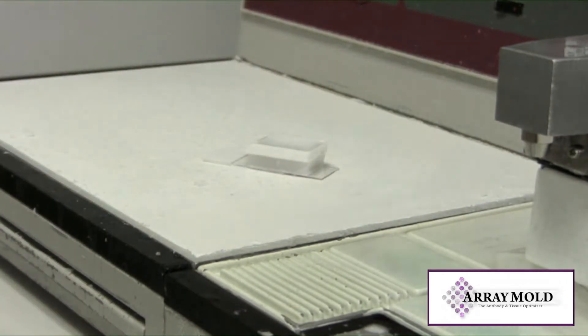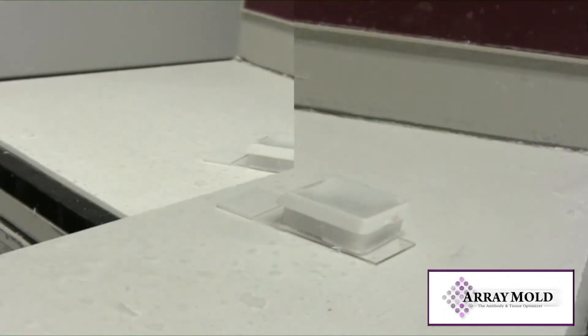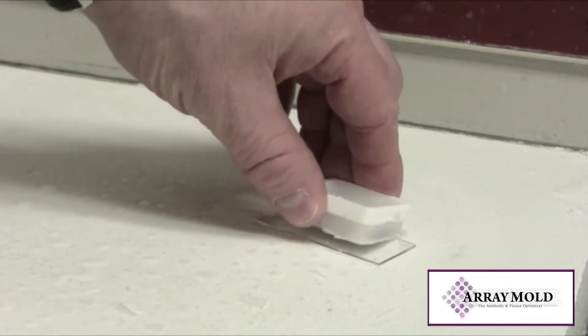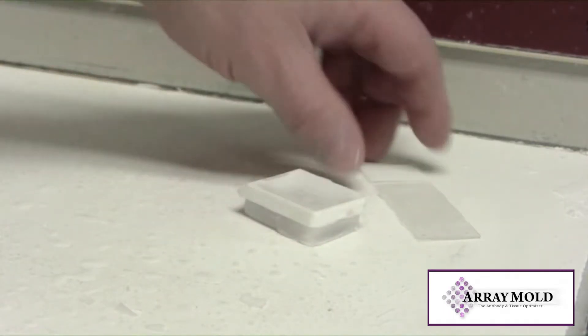Once at room temperature, place them together on a cold plate or ice tray for at least 15 more minutes to cool. Now the slides should come away easy from the paraffin block.